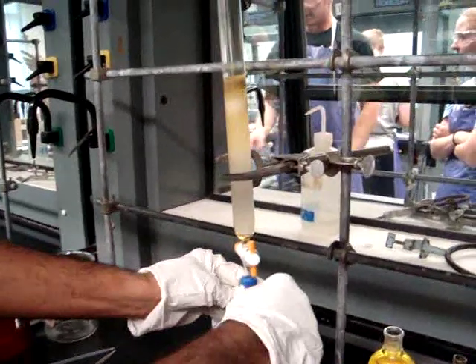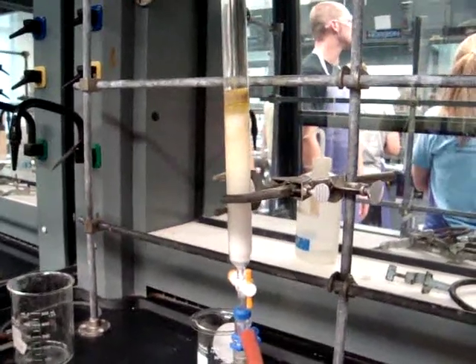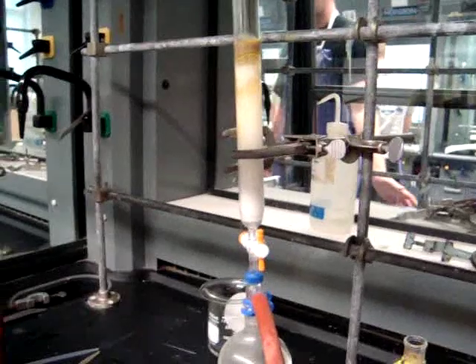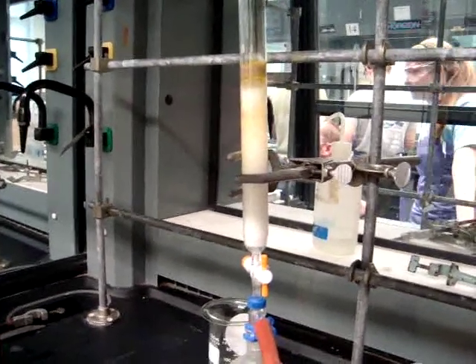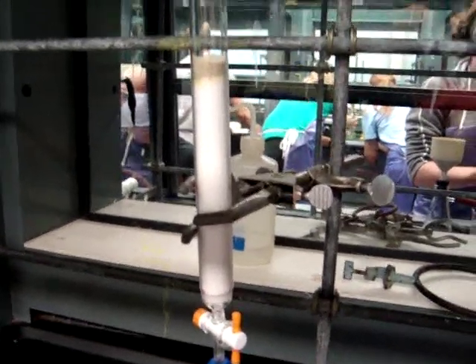While one person is rotovapping your products, the other person can dry out the column. Turn on the vacuum, open the stopcock, and let the system dry out completely before you try to remove the silica or the sand from the column. Once the column is extremely dry, it will be easy to pour out the silica and the sand. As you can see, since it's been under vacuum it is now completely dry, and you can discard it.